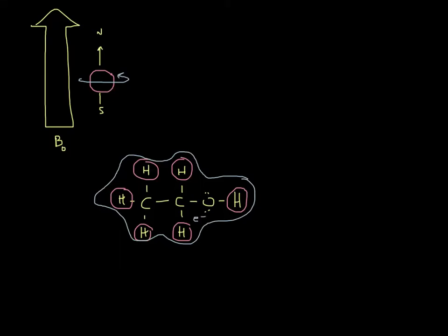What the NMR does is it allows us to see the different amount of shielding around a nucleus. All right, which sounds very odd, but bear with me. Each of these little nuclei, right here, right here, right here, here, here, and here, all of them have an odd mass, so they're all spinning in little tiny circles. So they are all generating little tiny magnetic fields.